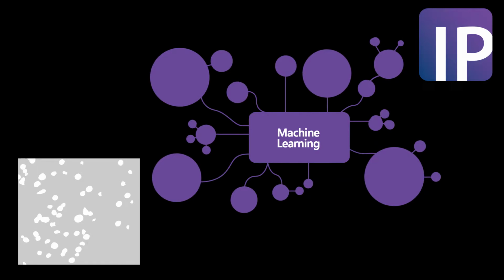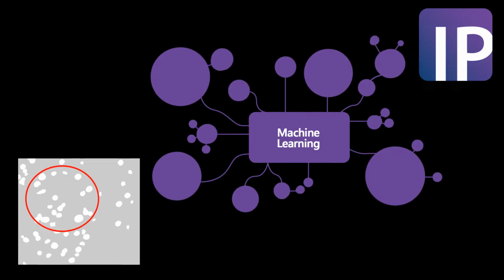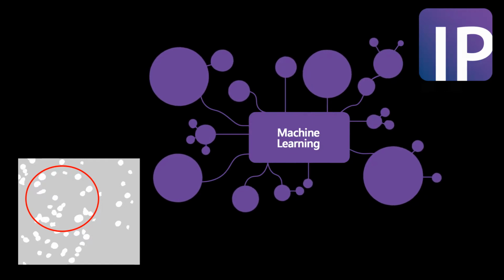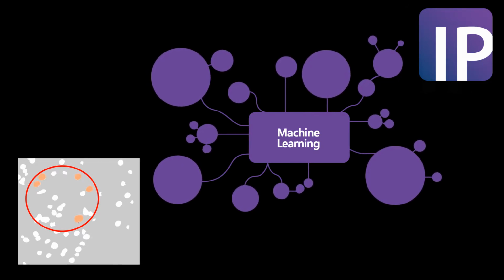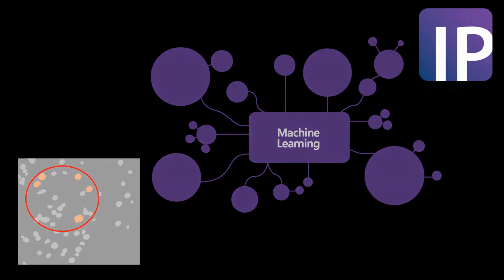In some instances, structures may be difficult to isolate due to little differentiation between the objects of interest and the background of the sample. To further assist in targeting specific structures of interest within the sample, users can limit the scope of the analysis by targeting objects of interest using one or many regions of interest. This can assist in providing a specific location for smart segmentation to focus on during the first few stages.